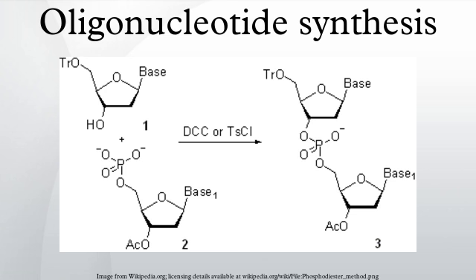The 5'-hydroxyl group is protected by an acid-labile DMT group. Thymine and uracil, nucleic bases of thymidine and uridine, respectively, do not have exocyclic amino groups and hence do not require any protection. Although the nucleic base of guanosine and 2'-deoxyguanosine does have an exocyclic amino group, its basicity is low to an extent that it does not react with phosphoramidites under the conditions of the coupling reaction.